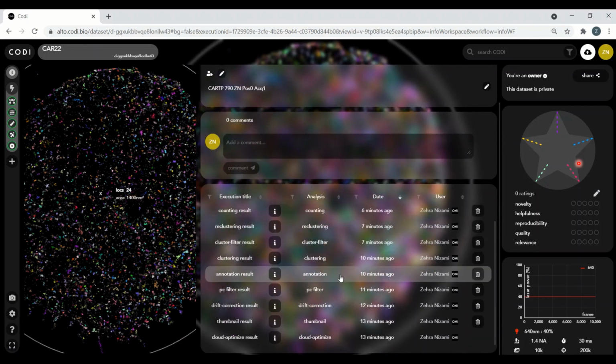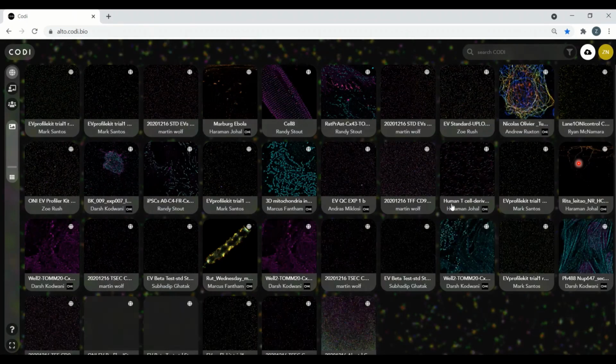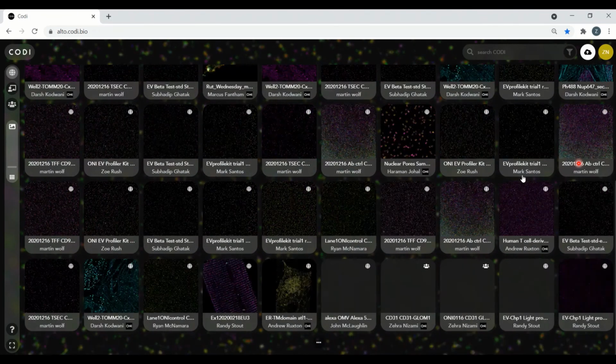There's a lot we can do, but the great thing is that you can see everything I've run, and that list of everything I've done is collaborative. So you can see all the executions I've run, every other execution other users have run, and then you can see the gallery of data that all of the people who wanted to publicly display their particularly highlighted data sets can show here. And you can of course keep data sets private. We have features called projects that allow you to keep it within your teams, but also make it really easily available so that you can share your data with people who want to analyze your data. And it's really a great conduit towards things like citizen science and so forth. So it's very exciting.